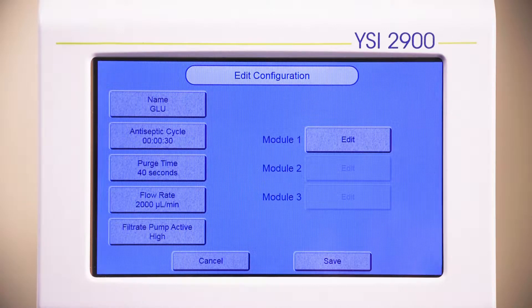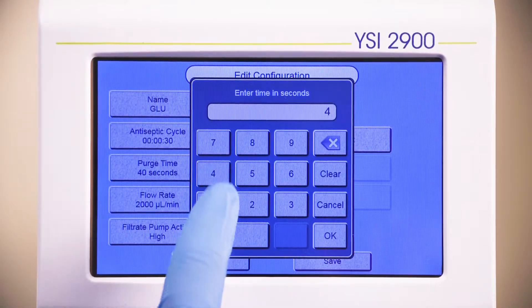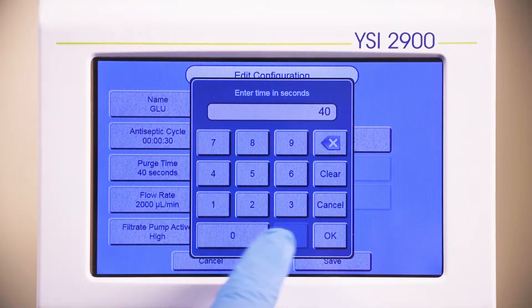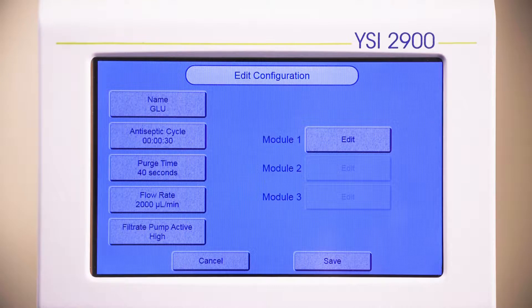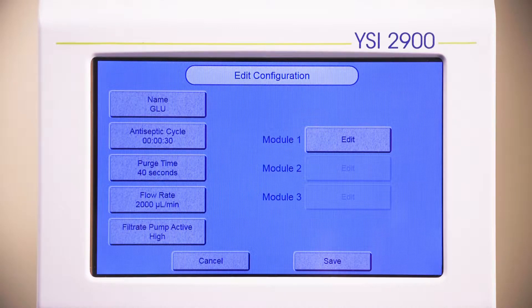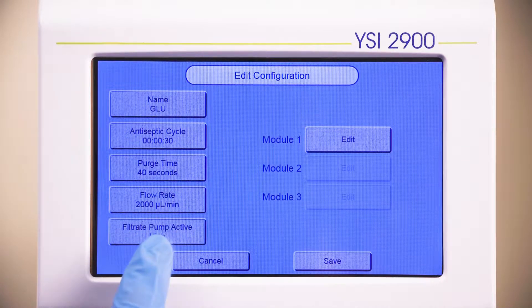The purge time defines the time that the pump will run in order to remove any old material within the lines. The default setting is 40 seconds and can be increased depending on the flow rate, the distance from the bioreactor, and the volume of the sample line. If an external filtrate pump will be used, refer to the 2900 series manual for information on the flow rate and filtrate pump active functions.